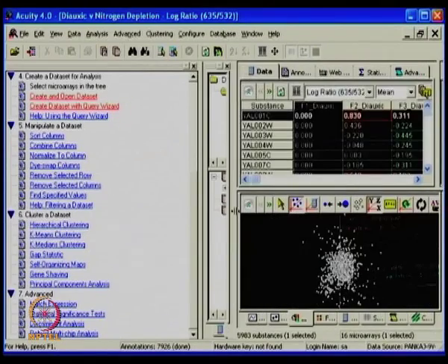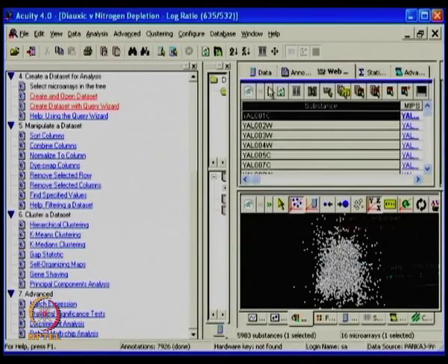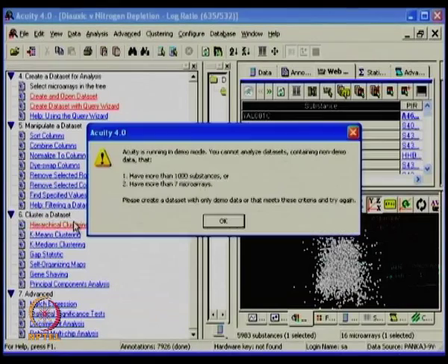Another important thing is that whichever is bluish in color, that particular one you have selected to work with. So this is filtered data, and it is allowed to work with. And when I hit a kind of clustering possibility, it says you need to create a quick data set.